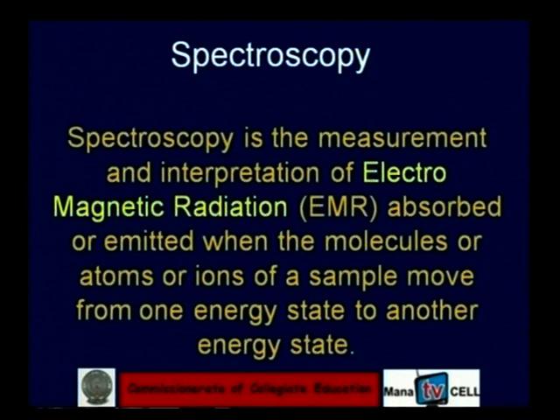One indicates that the darker one is more concentrated and the lighter one is less concentrated, which means that as the color of the solution deepens, the concentration of the substance present in the sample also increases. This is the basic principle of spectrophotometry.